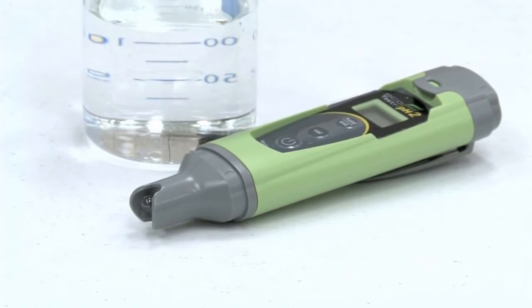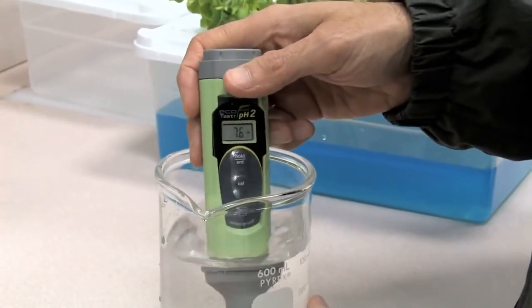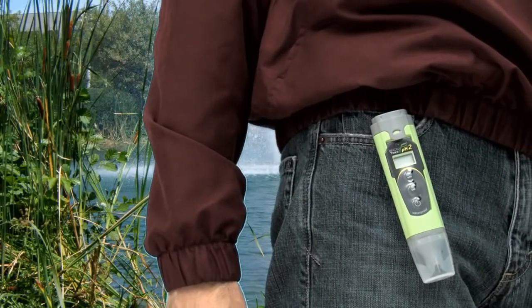The non-replaceable sensor keeps costs low. No need to worry about students or technicians losing or breaking them. And a built-in belt clip keeps the tester close by when needed.